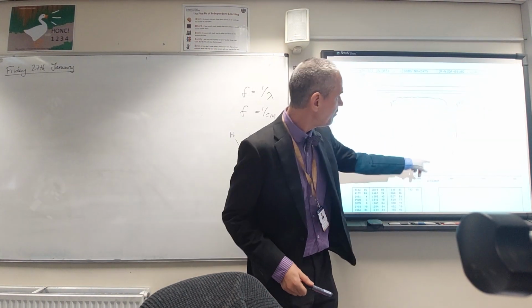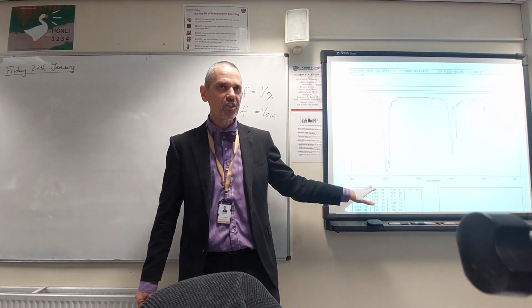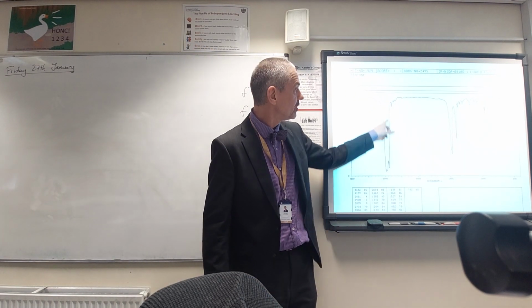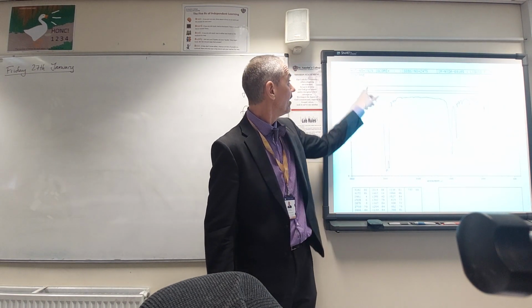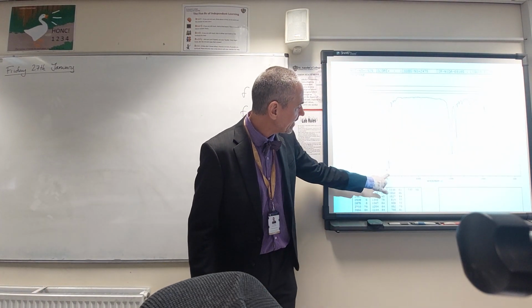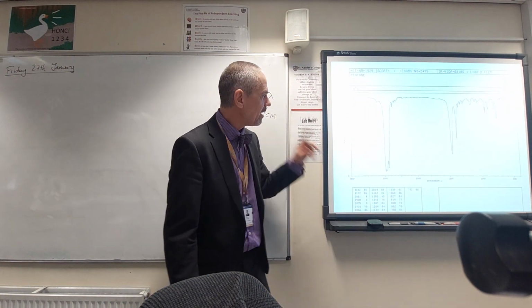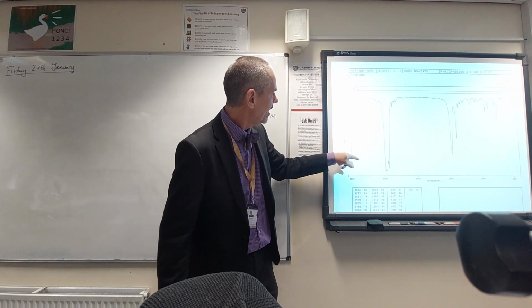On the left here we have usually some fairly clear peaks which we can identify easily. As I said, 2850 to 3000, that's CH, and there they are. There's a whole bunch of CH stretches there. And this is pentane, so we've got a lot of them, 12 of them. You can see there's lots of different peaks all overlapping there. We call them peaks, even though they're kind of dips. But if you turned it upside down, they'd be peaks, wouldn't they?